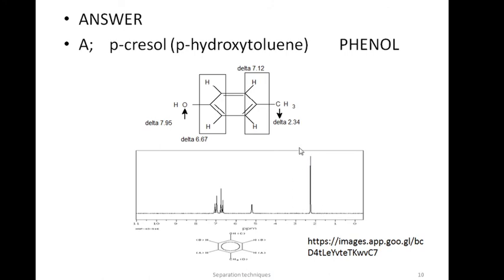This corresponds to CH3. These two sets correspond to these two types of protons, right? And this one has been shown here in your textbook. The value was here. Okay, don't get confused. If they tell you exchangeable protons, it depends upon the type of solvent taken, right? If you do not allow exchange to occur, the OH may come here. If you allow exchange to occur, it will go high. Okay, so this is how your NMR spectrum is going to look.